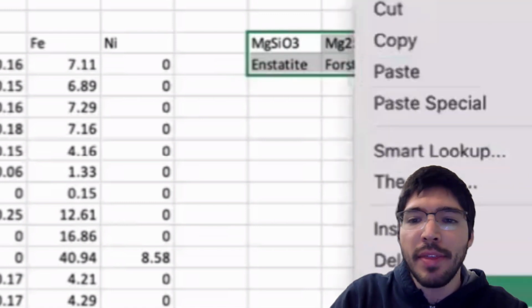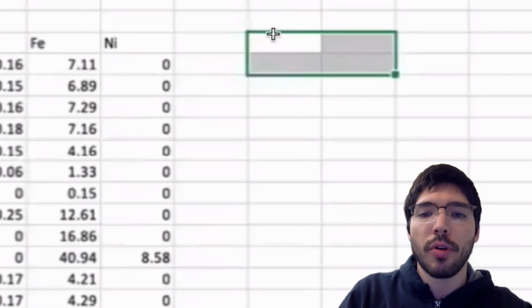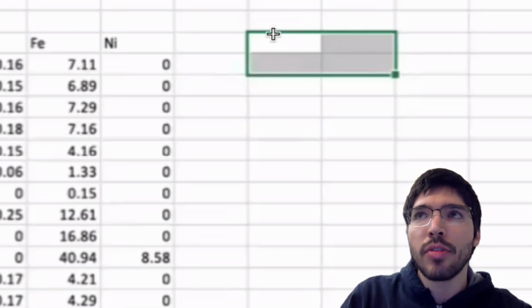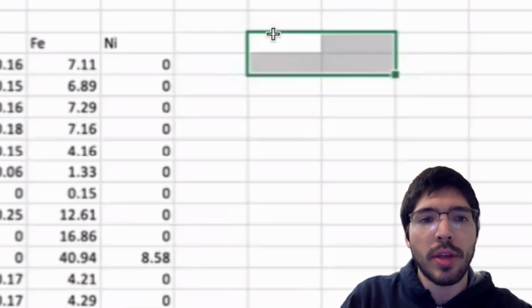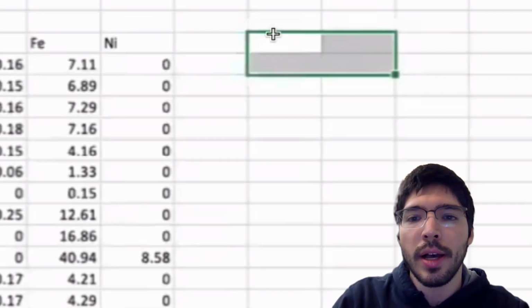If you get anything different, then you either have some sort of contamination, which can be a result from things like weathering, or you have 2 phases that are mixed, or you don't have a stoichiometric mineral per se, which may indicate you have something else that doesn't necessarily give the best data. So we want to make sure we have clean data.